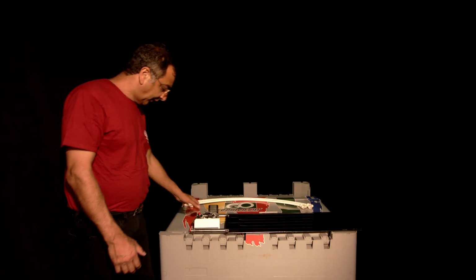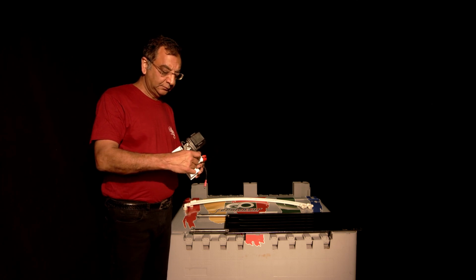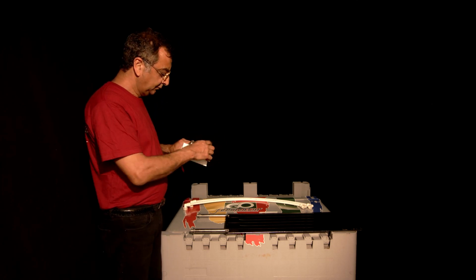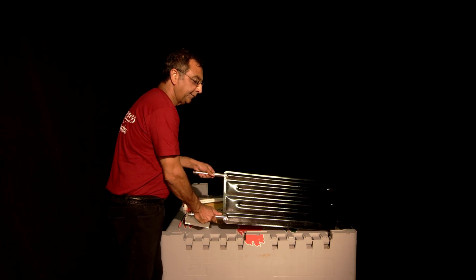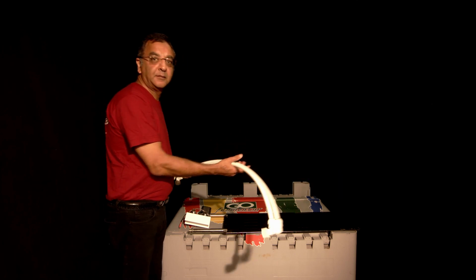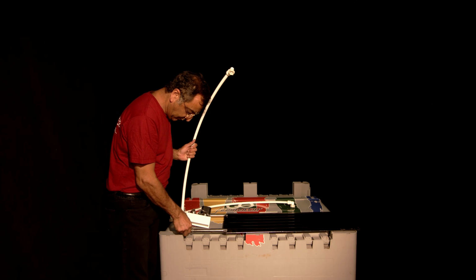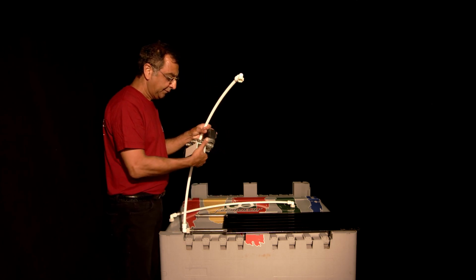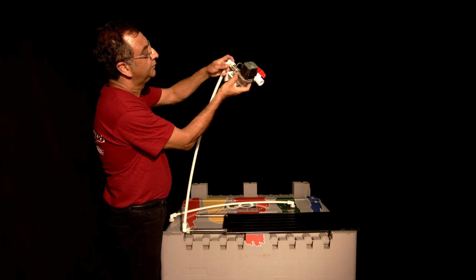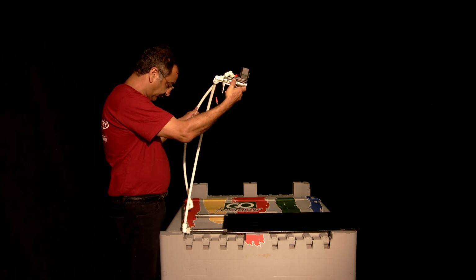Then just disconnect it, that shuts it off from the bag, and you can take your sample off in the lab. You may have an optional cooler, so there's a cooling valve assembly which opens automatically when it needs coolant. You need to connect this to the cooling plate, which is a big stainless steel square section. And you also have two white tubes that connect the controller to the cooling plate. So first screw one of these cooling tubes to the end of the cooling plate. The other end goes onto the stainless nipples on the valve assembly. And the second one is put on exactly the same way, from the second tube to the second port.